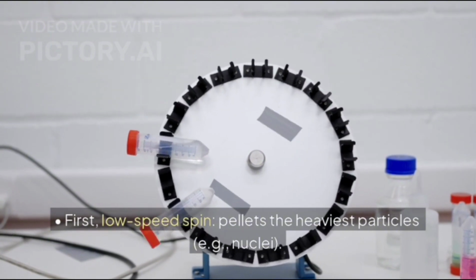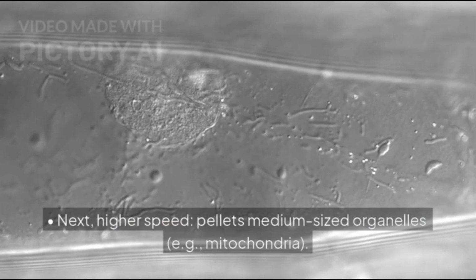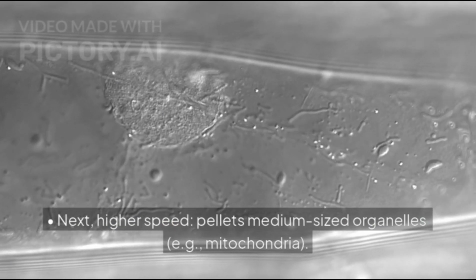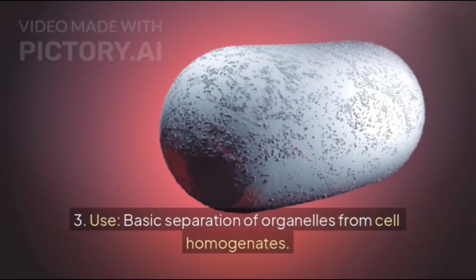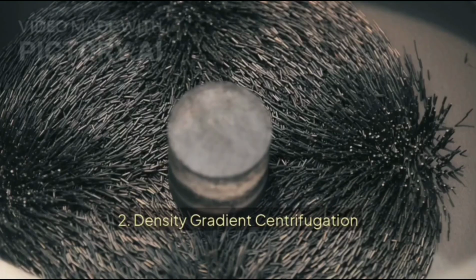First, low speed spin pellets the heaviest particles like nuclei. Next, higher speed pellets medium-sized organelles like mitochondria. Final high speed isolates small particles like ribosomes. Use: basic separation of organelles from cell homogenates.